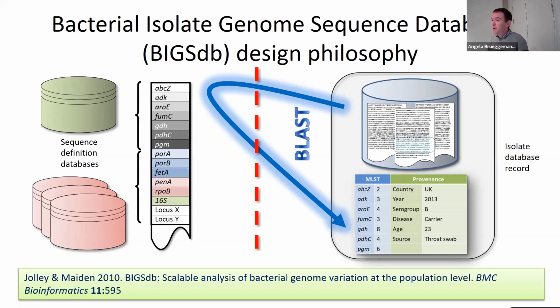That's if you were doing it on the command line as a sort of background process. Many of you may have done it through the web interface, in which case you're doing it on a single core, and depending on how you're doing it, it might be doing it locus by locus. So that tends to be a lot slower. But for the routine scanning of new genomes that go into the database, we'll do it multi-threaded, with a big query searching everything at the same time.